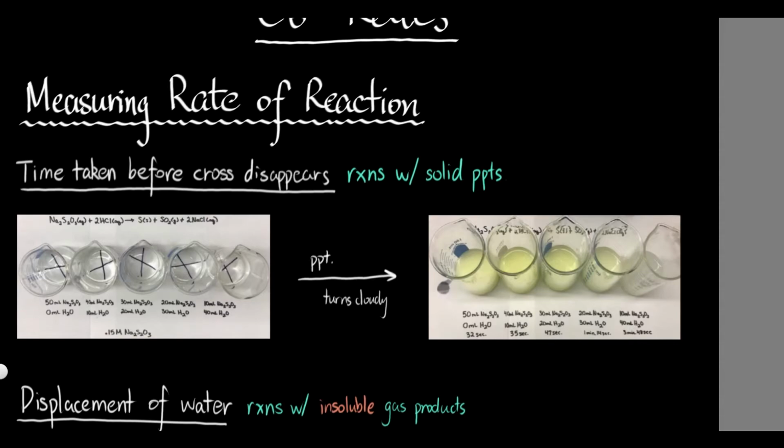And basically it times, I suppose maybe 30 seconds or whatever, the time it takes so that the cross on the bottom is no longer visible.